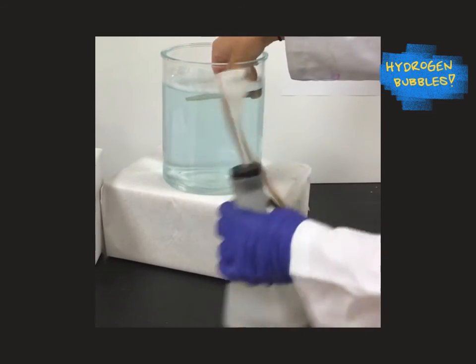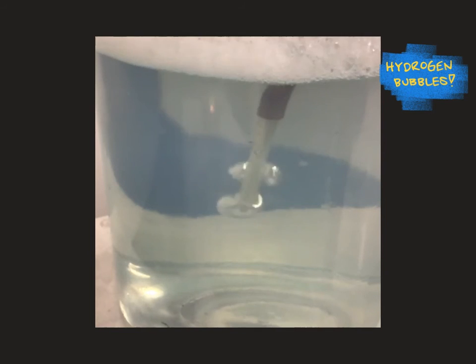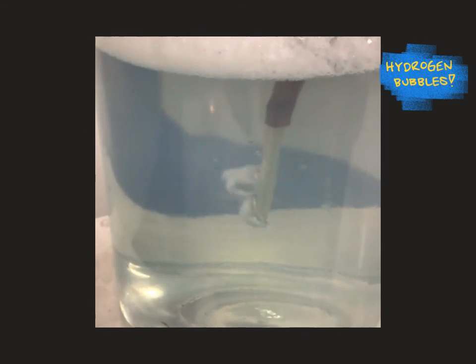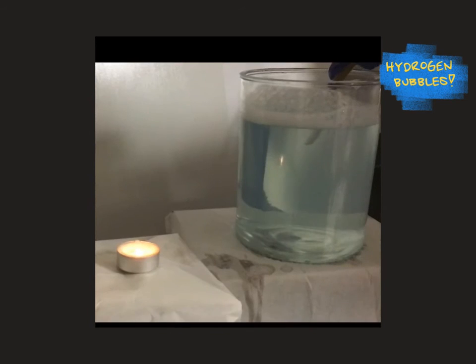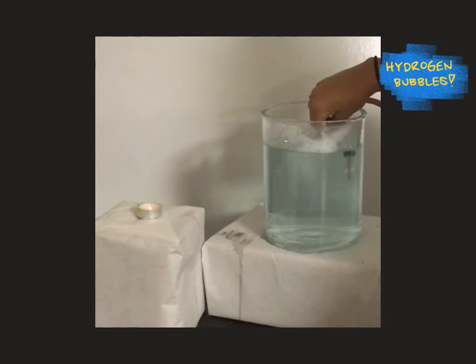And those bubbles that are now going to form at the top of our water are filled up, you guessed it, with hydrogen gas. Once we collect enough of them at the surface, we're going to very, very carefully scoop those bubbles up in our hand, and you'll watch here as our demonstrator scoops up the hydrogen bubbles and brings them close to the candle flame down below, and we'll see the results of our experiment.